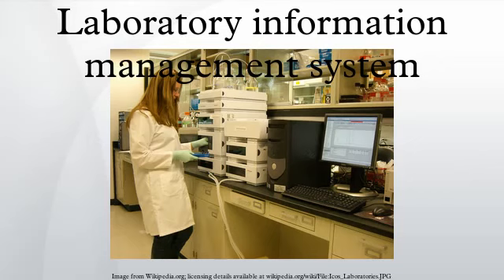Historically, the LIMS, LIS, and Process Development Execution System have all performed similar functions. Historically, the term LIMS has tended to be used to reference informatics systems targeted for environmental, research, or commercial analysis such as pharmaceutical or petrochemical work. LIS has tended to be used to reference laboratory informatics systems in the forensics and clinical markets, which often required special case management tools. The term PDES has generally applied to a wider scope, including, for example, virtual manufacturing techniques, while not necessarily integrating with laboratory equipment.